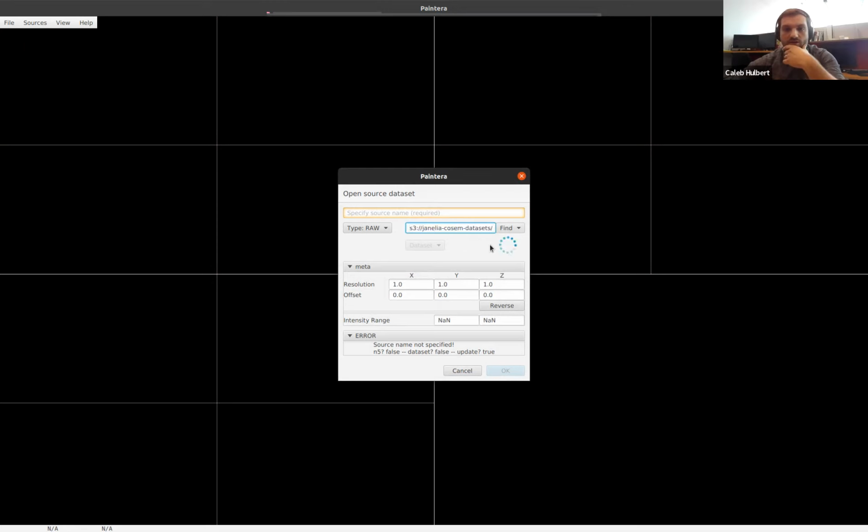Make sure it's the right thing. Looks right. Okay, so now you'll see it's loading. It's a really large data set, so it's going to take a little bit to load, but also you have the latency because it's remote. And I say a while, I just mean it wasn't as fast as maybe you saw for Alyson. It's not that it's super slow either.